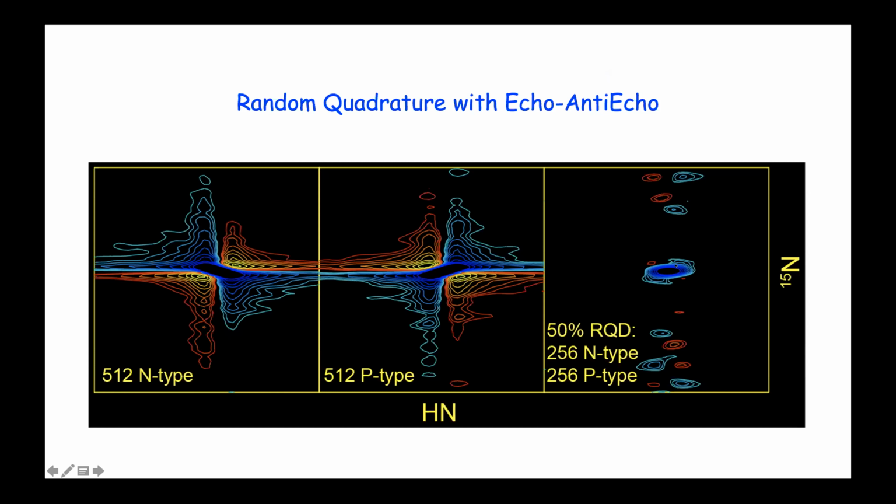And therefore, SMILE works. Otherwise, SMILE would not even work, okay? The problem here is that the artifact is really dispersive, so baseline correction is a little bit harder, because dispersive is broader and traced out and may be considered by a baseline correction program as noise.